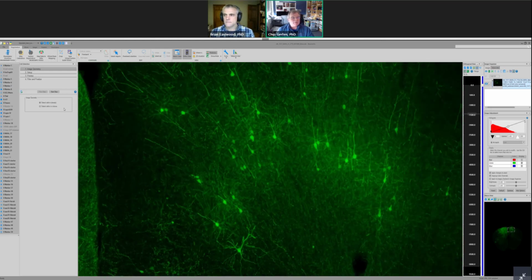The program has the ability to actually detect cells in a volume. Even though this is a whole brain volume, the whole brain volume was generated from sections that have been compressed using deep focus. The 50 micron section had 7 planes, and those are compressed together. Another option would be to not do the deep focus and use the 3D detection algorithms built into this, which would have let us detect these in the original volume. But what we're going to show now is the 2D cell detection.